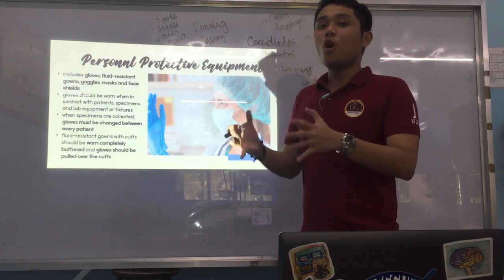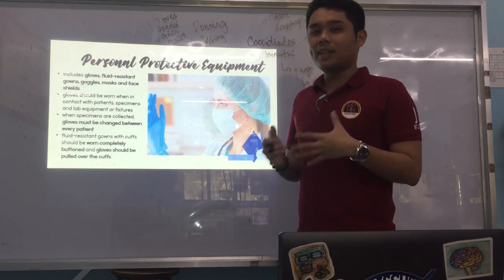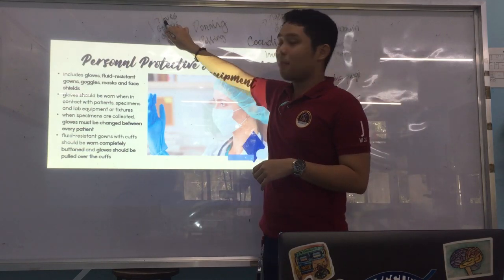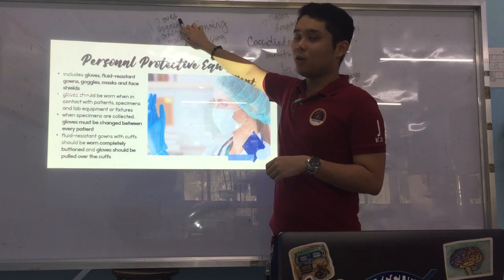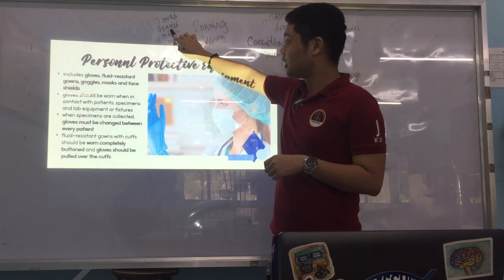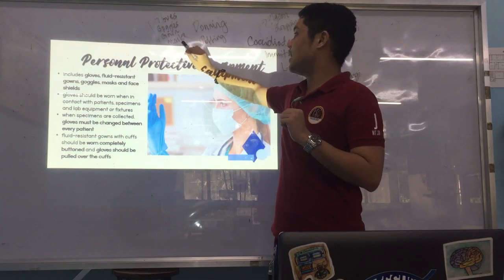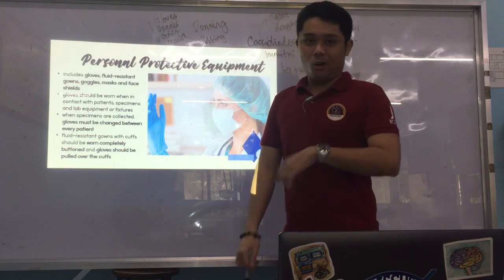For doffing — how to take off PPE — the order is alphabetical: you start with gloves, followed by goggles, then gown, and finally mask. The logic is that gloves are the most contaminated and should be removed first, and the mask — the most protective — is removed last.